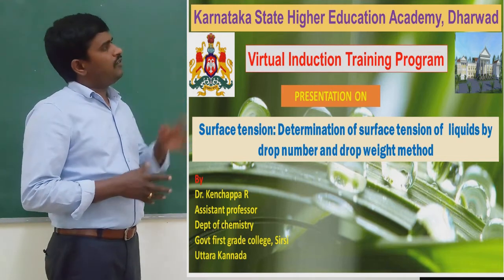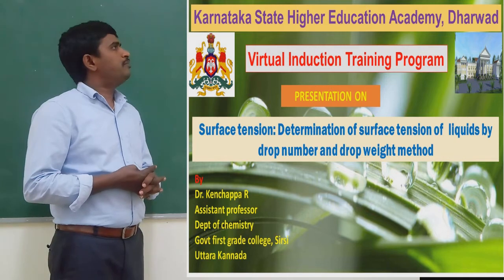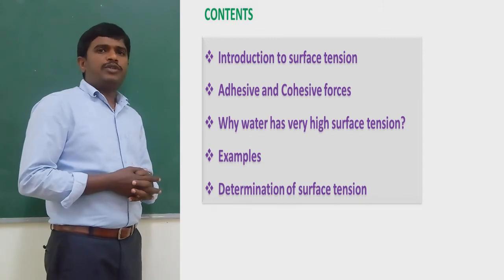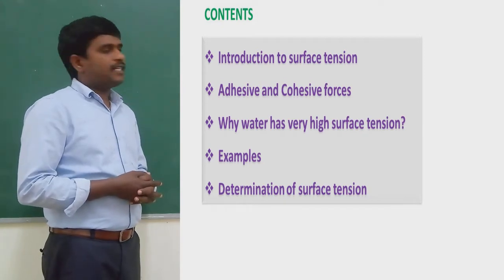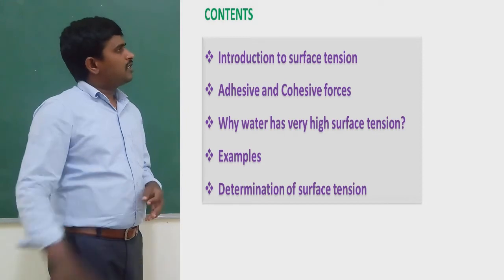Determination of surface tension of liquids by drop number and drop weight method. The presentation contains the contents: introduction to surface tension, adhesive and cohesive forces, why water has very high surface tension, examples for surface tension, determination of surface tension.